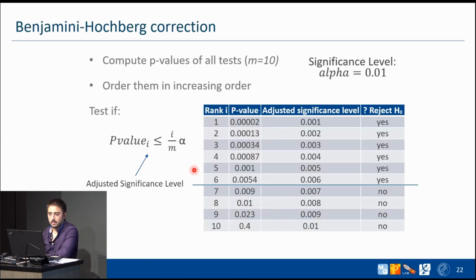Okay. We have a question here. Does Perseus have statistical analysis to do stats tests on non-normally distributed data? Because the assumption of a t-test is that your data is normally distributed, but obviously you can test for normal distribution and your data may not necessarily be normally distributed. So does Perseus have tools for non-normally distributed data?